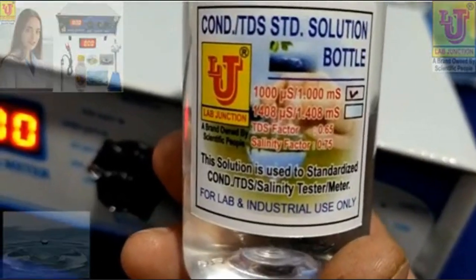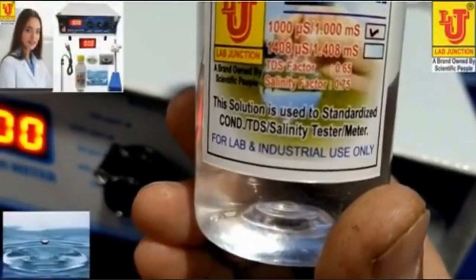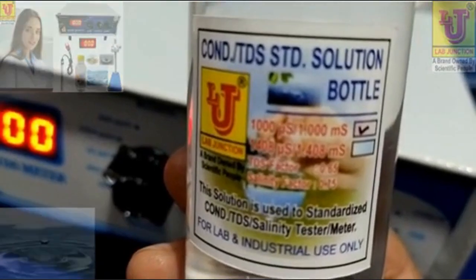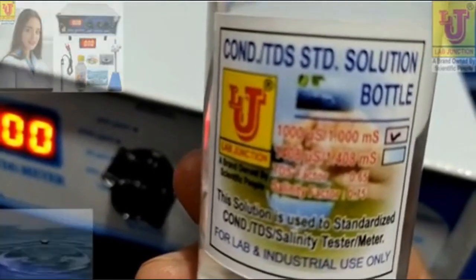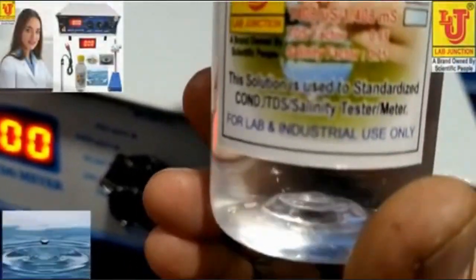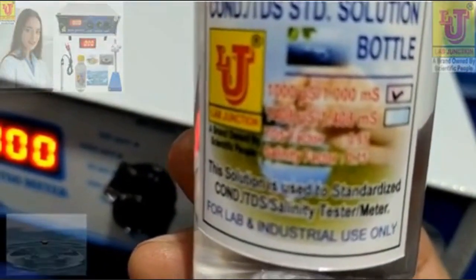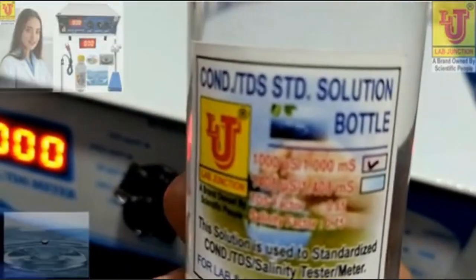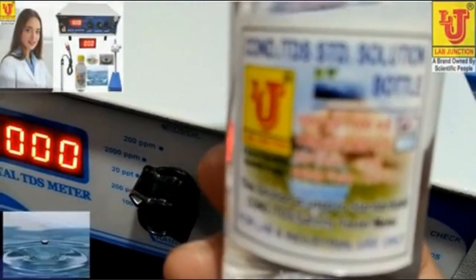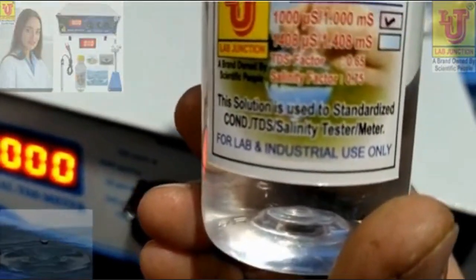This solution has values 1 millisiemens for conductivity and 650 for TDS and 0.75 for salinity. It means 750 value for salinity.